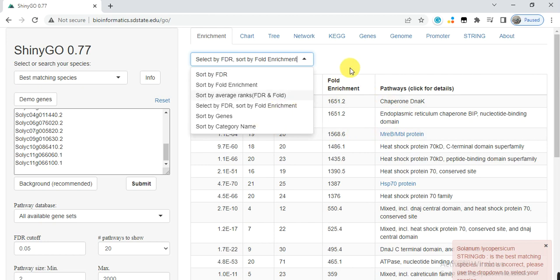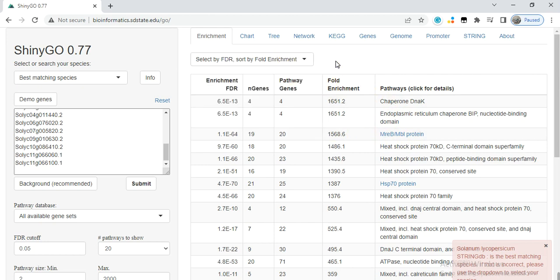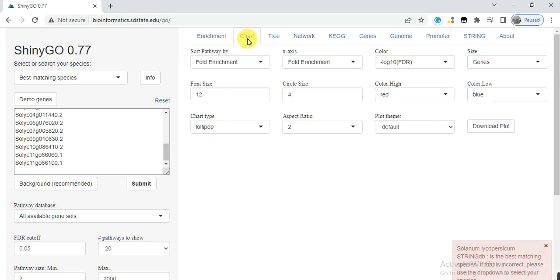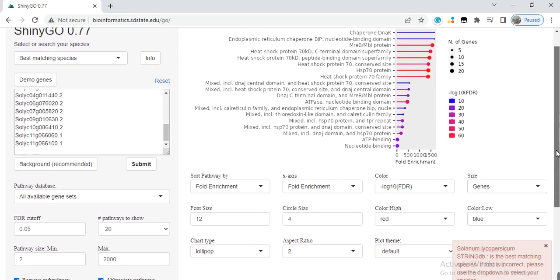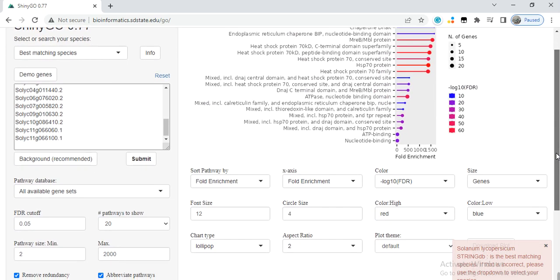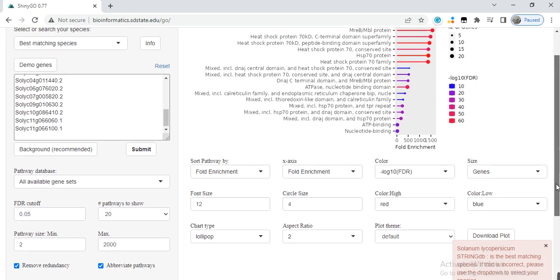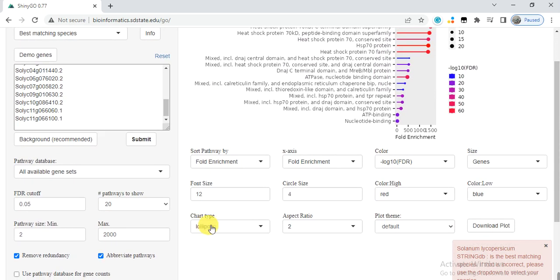Sort by genes or by enrichment fold, or any other way you want, and then click on chart. Here is the chart of our genes.